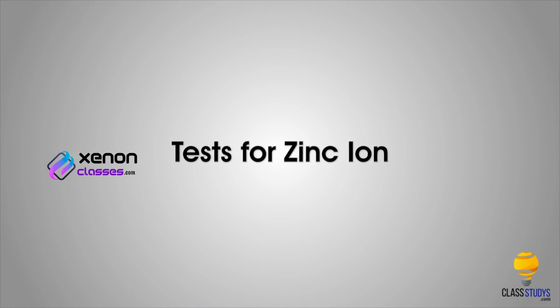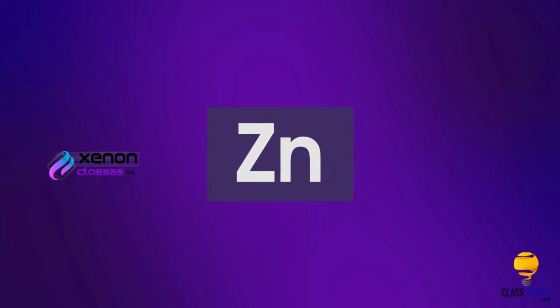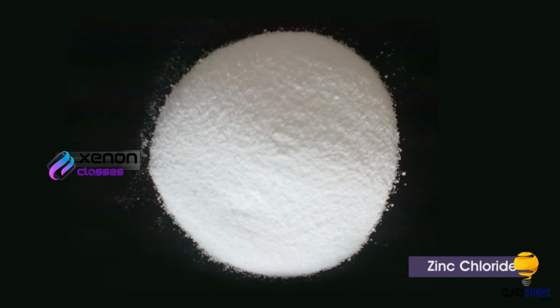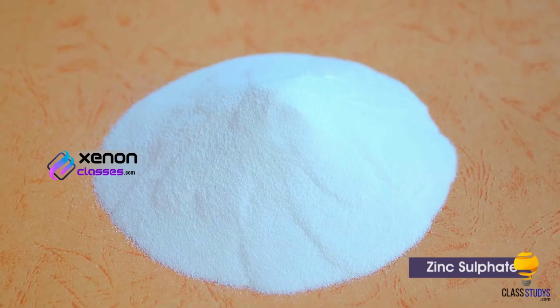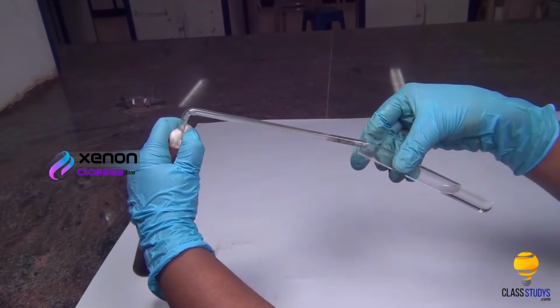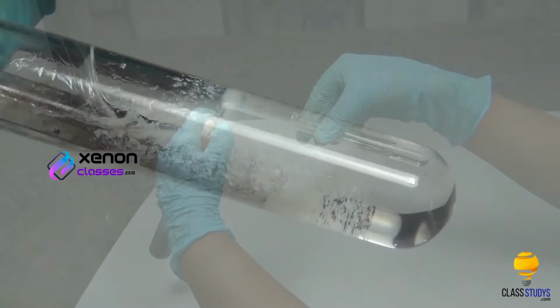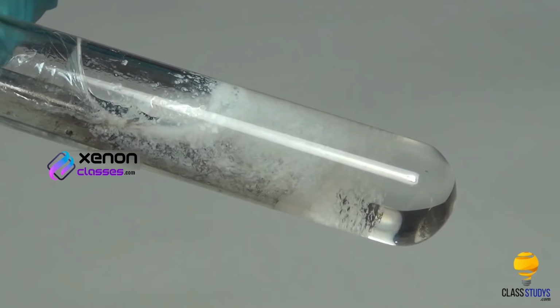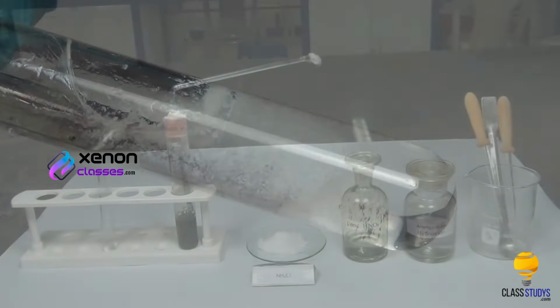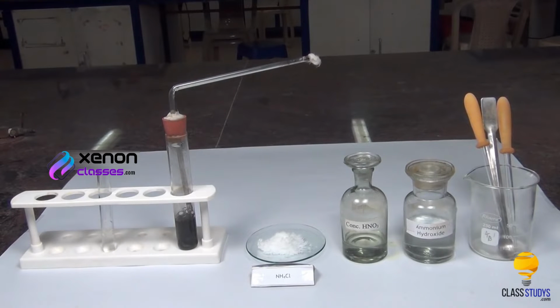Tests for zinc ion. Zinc is a chemical element with symbol Zn. It is found in various salts like zinc chloride and zinc sulfate as Zn2+ ion. In group 4, zinc ions are precipitated as their sulfides by passing hydrogen sulfide gas through their solutions. Our aim here is to test for the presence of zinc ion in a given salt.